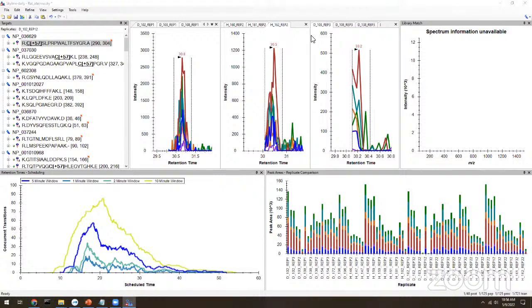But since then we have PROSIT integrated, and one of the things I now frequently demo is that you can see which peptides have spectra, and there are these little scratch marks on their icons, like a little spectrum right down at the lower right corner of the icon. Yeah, Lindsay's hovering the cursor over it.